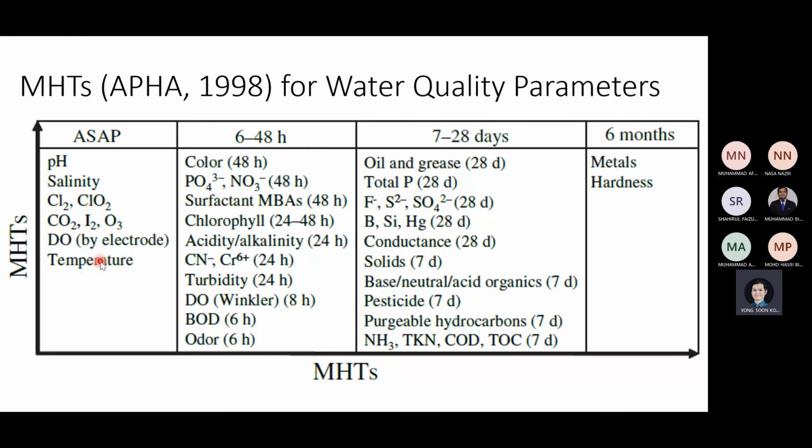There's a probe, and inside that probe there are several electrodes that you can dip into the water and take a reading straight away. No sampling at all. Just dip it in and there's a display panel where you can see pH and all of these things, some even more. Nowadays, technology has really caught up, at the advent of Industry 4.0. Some of these arrays aren't even connected using wire.